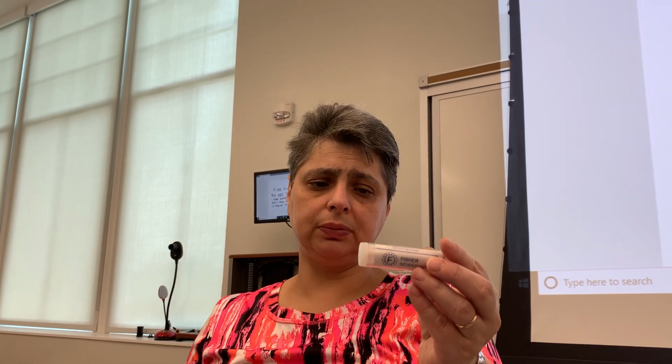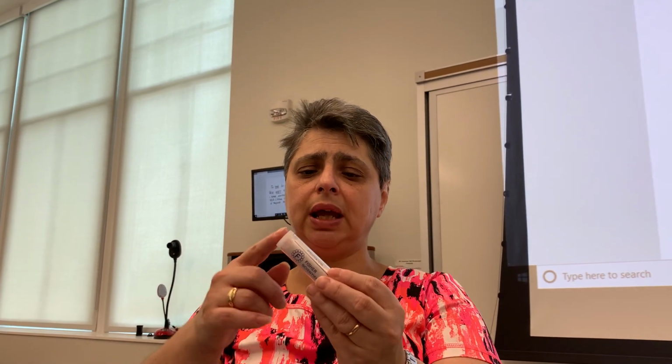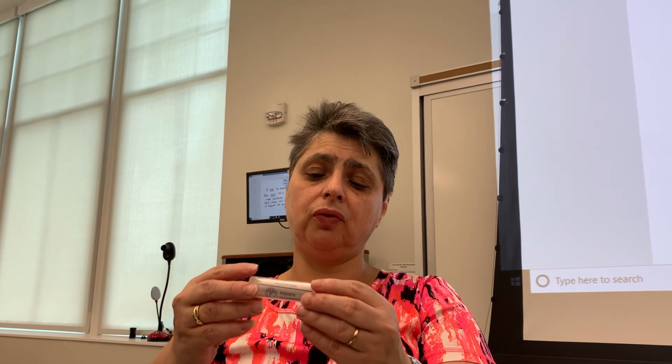Used strips should not be put in the sink. They should not be left on the bench. Please make sure to use a trash can next to your seat in order to place the used strip in there. The containers with indicator paper must always be kept tightly closed to avoid vapors from around the lab from contaminating the unused strips. So let's briefly talk about your report sheet.